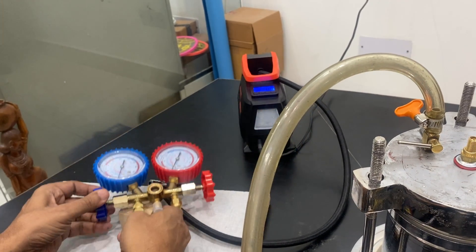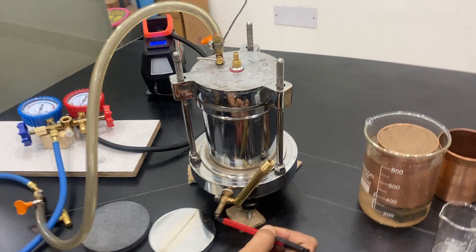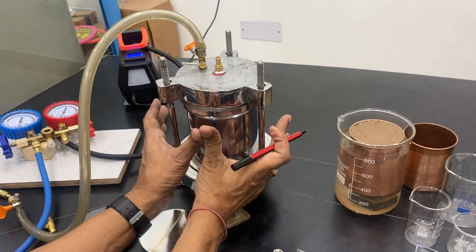When you open this valve, it gives you the pressure reading — how much pressure is there. This is the input, and the extra water inside the chamber will come out through here. In all experiments, you have to keep it closed so that the pressure builds up inside.